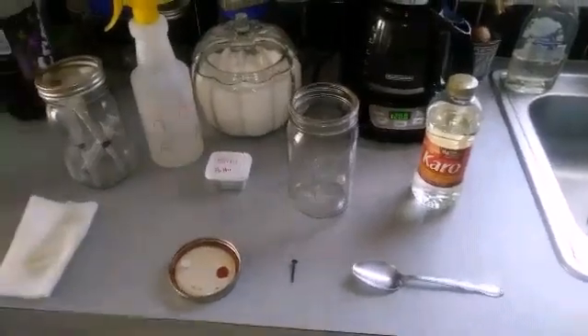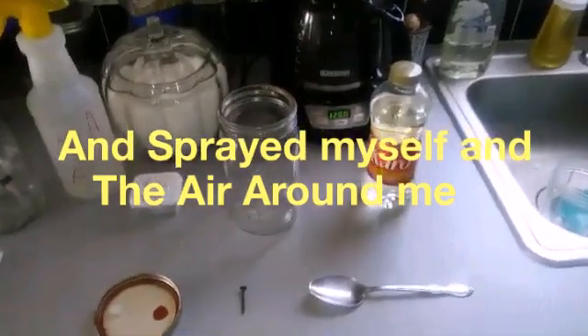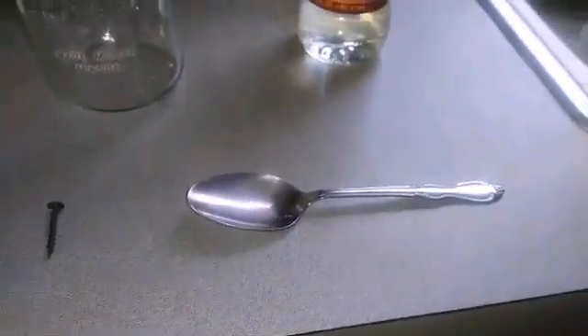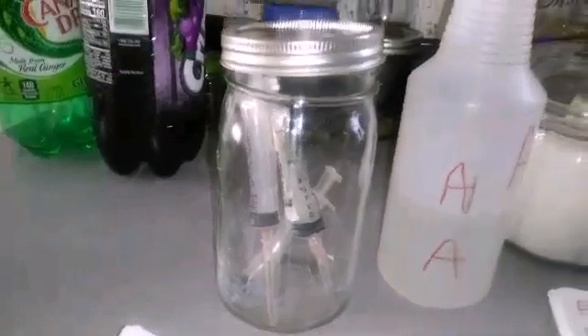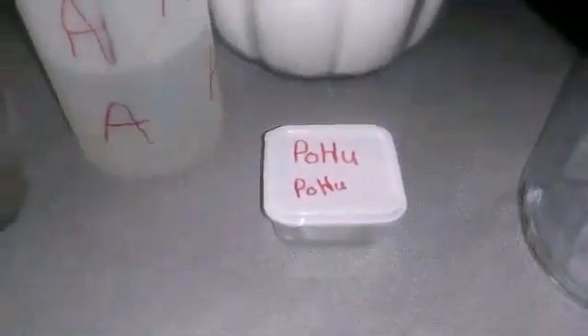I've already wiped my area down with alcohol. Now we're going to make the liquid for the liquid culture. For the spores we're going to use Karo light corn syrup. There's my syringes — I like to pressure cook my syringes in a jar so I can just pull them out as I need them and they stay contaminant free. There's my alcohol spray bottle and there's my spore prints on aluminum foil.